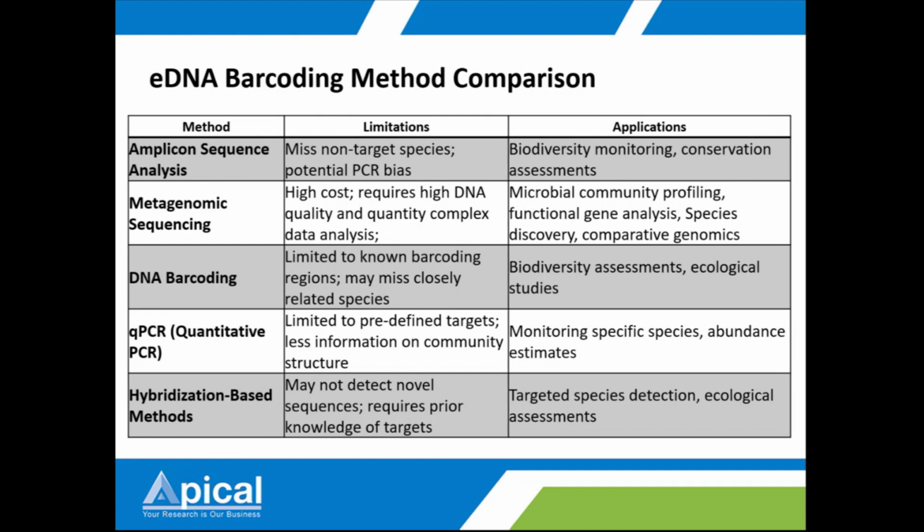For application, amplicon sequencing is useful if you want to do biodiversity monitoring and conservation assessment because it's very wide. It's not limited to a small number of organisms. So this is a very good approach for biodiversity monitoring and conservation assessment.